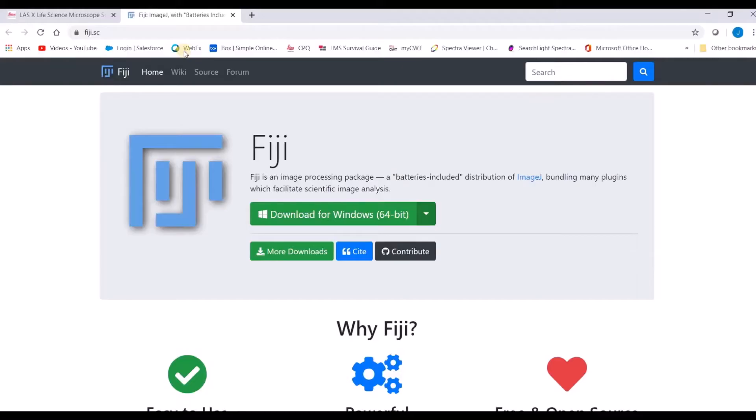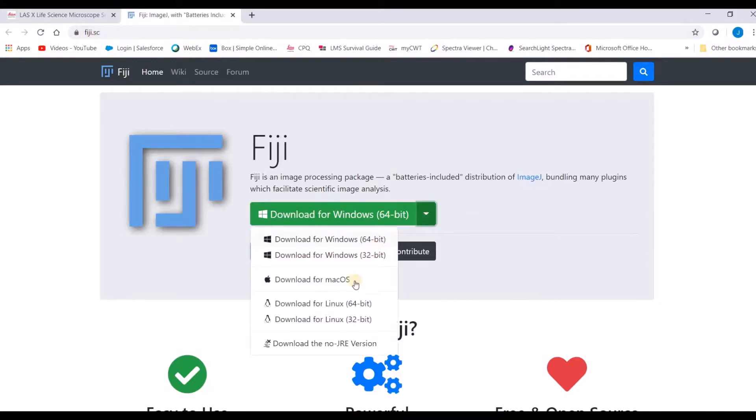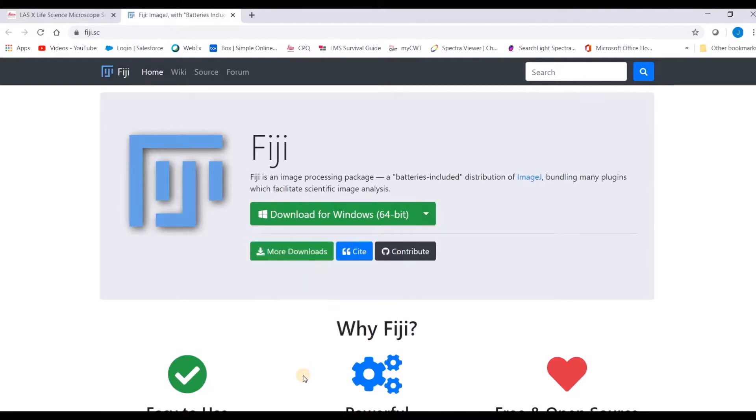In this video, we are going to go over how to open LIFF files in Fiji. Fiji is an open source software that is available for free at this particular website, Fiji.sc. Please go ahead and download the version that is appropriate for your operating system.